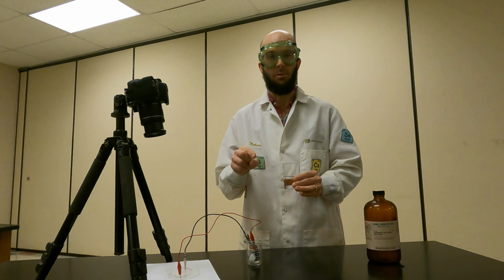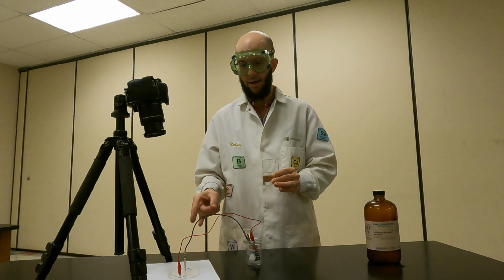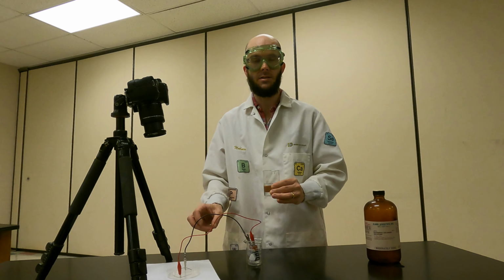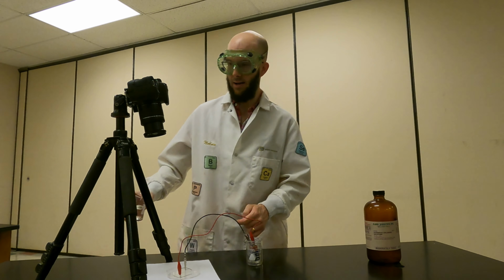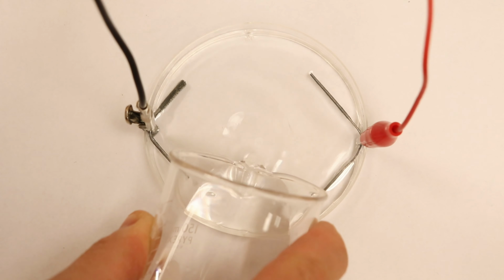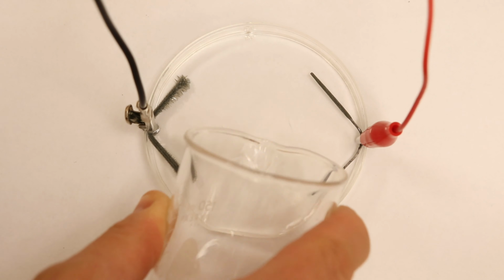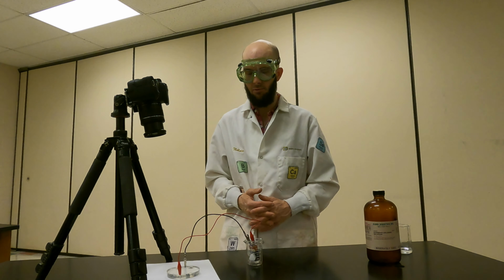into it. I'm going to supply that energy with a 9-volt battery, which I have secured using red and black electrodes to this petri dish. I've attached pieces of paper clips to the electrodes to increase the surface area, so here comes our tin chloride. So I've added my tin chloride to the solution and I'm supplying energy in the form of that 9-volt battery.